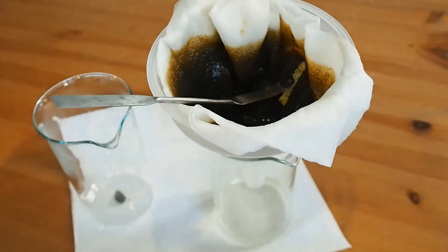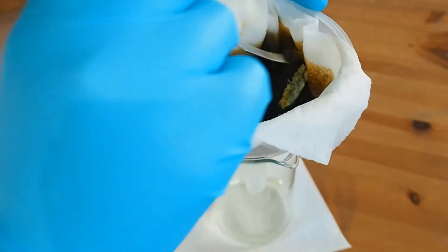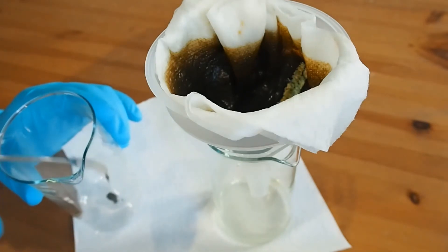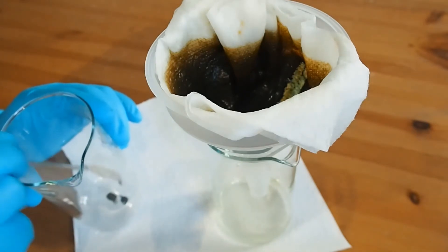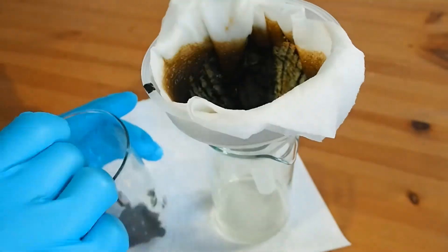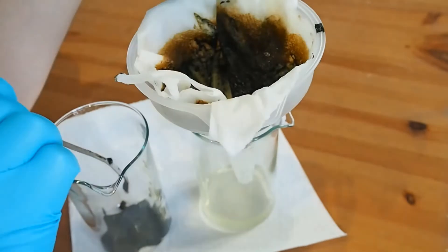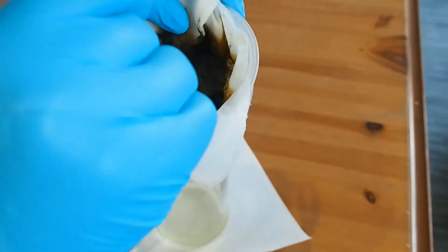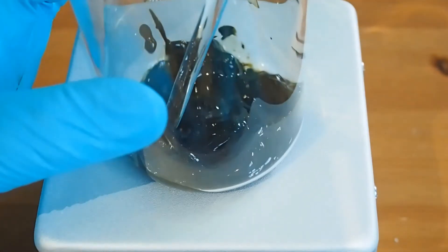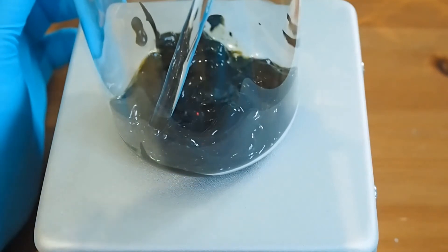So I can start clearing this material — it's in the filter — just by scraping it up and dislodging it into the beaker. What we're going to do is heat it to drive off the water and convert it into the iron oxide rust.